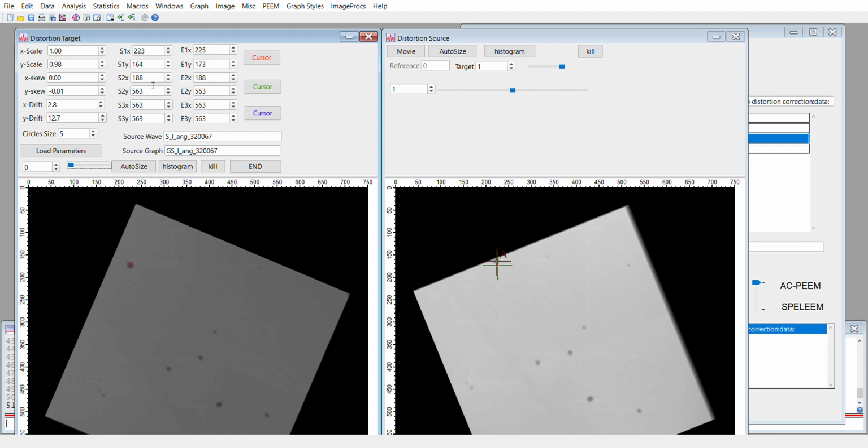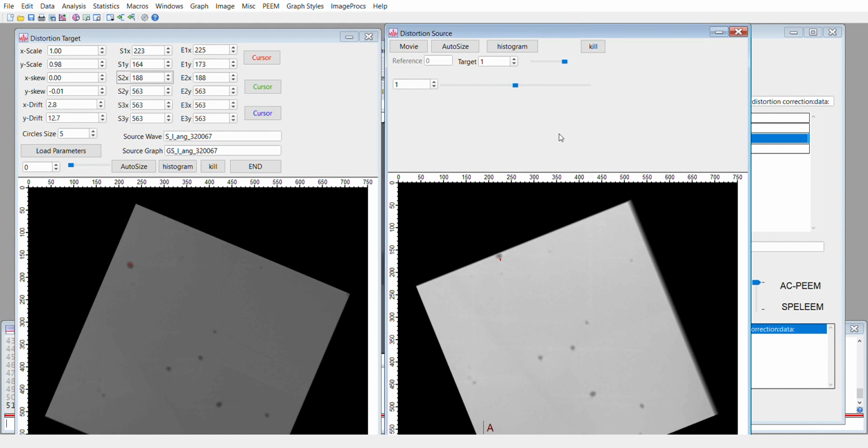Now we go to point 2. We do the same. We go on one of the fields of X or Y of the point 2. We press enter. This will move the pointer here across to the second point. We activate the interface by moving this slider. We click on the image and we move the slider, or we can also drag it to another defect. Always drag the slider which has a big cross, not the one without the cross.